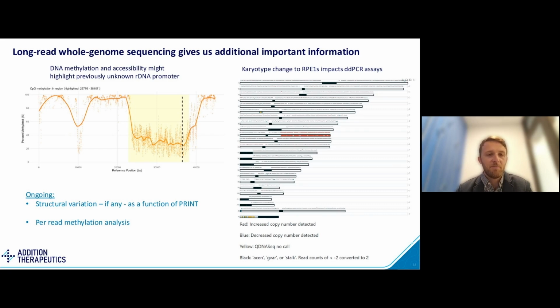And this shows us basically in the target site, which is in the dotted line in the coding sequence of the rDNA highlighted in yellow, what proportion of rDNA units are being actively transcribed, which from an rDNA genomics perspective is really interesting information because there's a lot of discussion about different numbers of rDNA units per cell, per tissue, per individual. So seeing how many are being actively transcribed in relation to how many actually exist in the genome is really useful information.